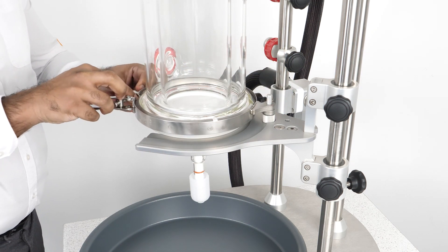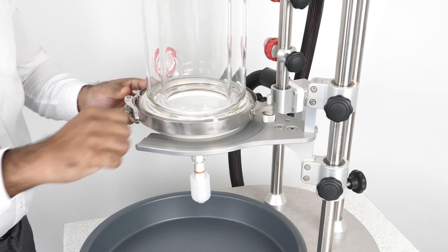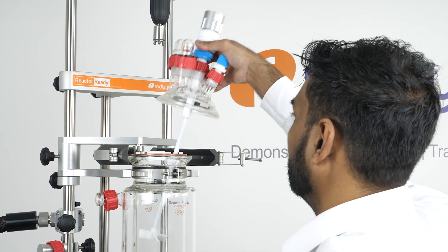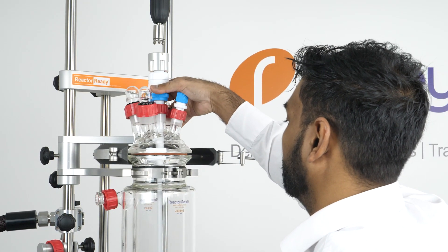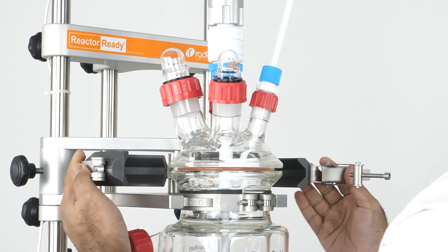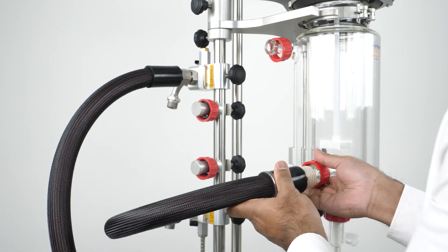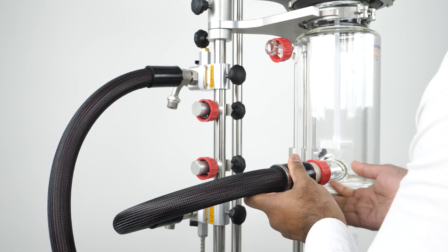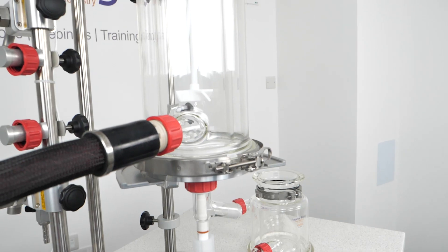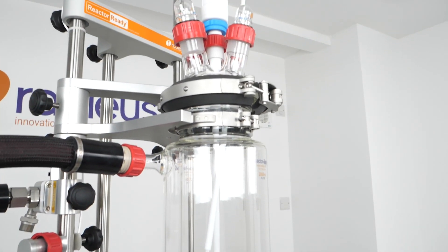Now that we've assembled the filter plate and attached it to our vessel, assembling the rest of the system is just like putting together a standard or process Reactor Ready vessel. First we replace the vessel o-ring in the PTFE collar and then the lid. We then connect our manifold-to-vessel hoses, which provide the temperature control from your circulator to the vessel. You can also use our filter vessels purely as a filter without a circulator if you don't require temperature-controlled filtration.